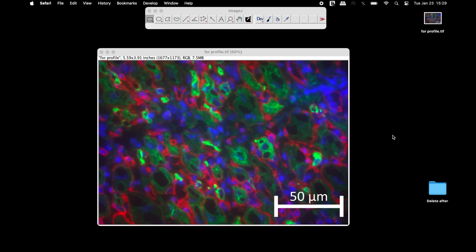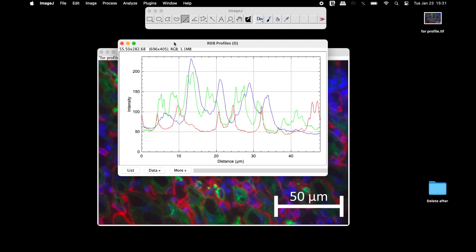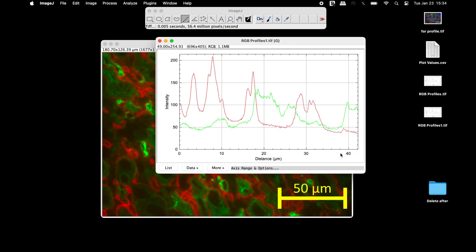We will generate the red, green and blue profile plot of an RGB image using ImageJ.